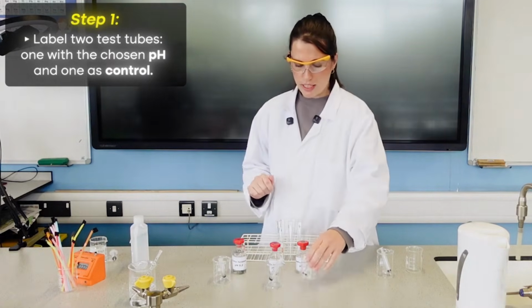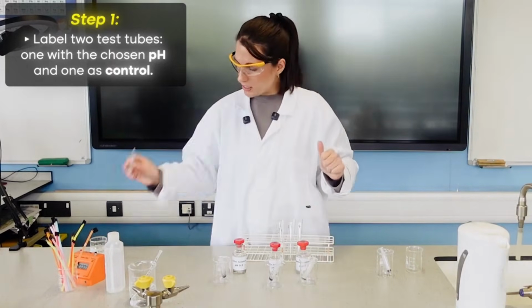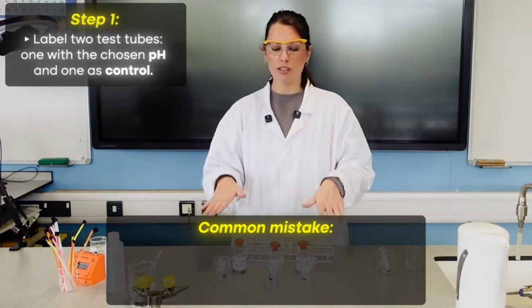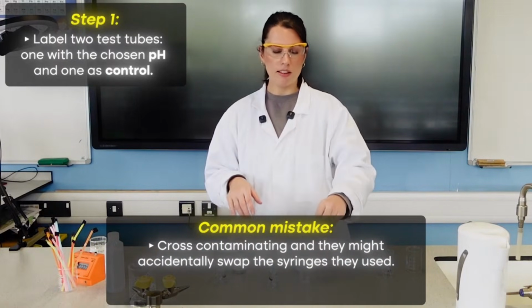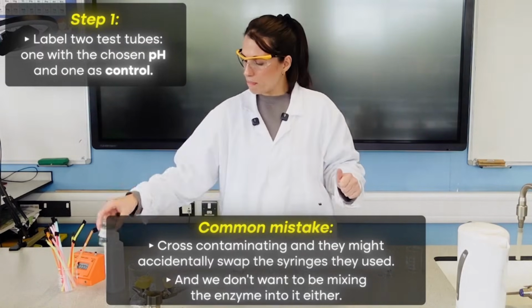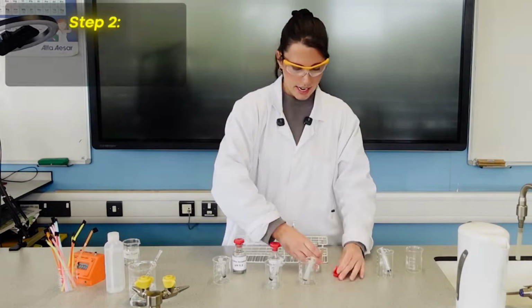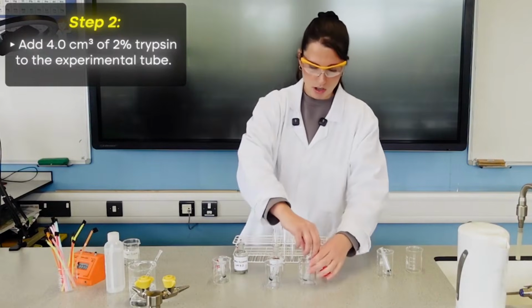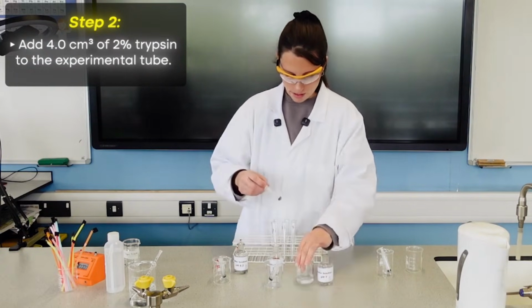I've also got a separate syringe for each of those buffers and a separate one for the trypsin, because one common mistake that students will make is cross-contaminating, and they might accidentally swap the syringes they use and they don't necessarily have the exact pH that they think, and we don't want to be mixing the enzyme into it either. Okay, so that's the next thing I'm going to do then is add 4 centimeters cubed of each of these to those.